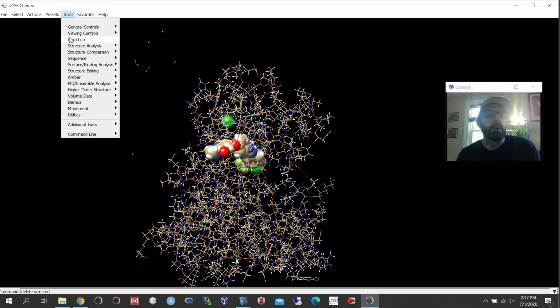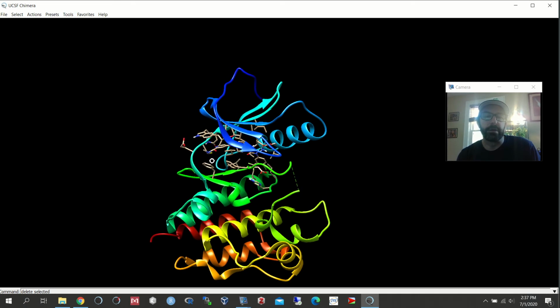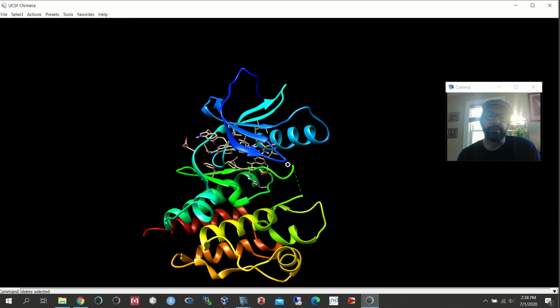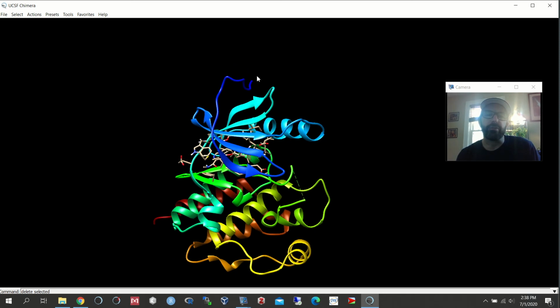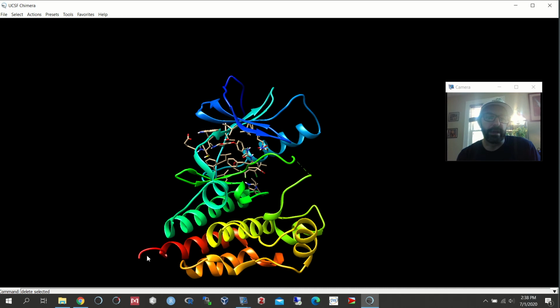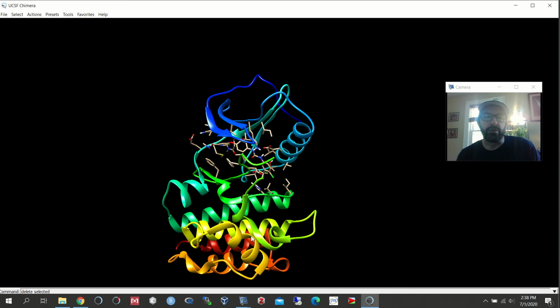Now, I'm not going to really see hydrogens in that ribbon preset, but if I go back to my ribbon preset, since I have only one chain left in my structure, it'll actually color it as a rainbow. So essentially this is the C terminal or the end in red, and then in blue I have the N terminal. So the protein starts here, and then the chain sort of follows the rainbow until it ends up over here. So that's another way you can look at proteins.